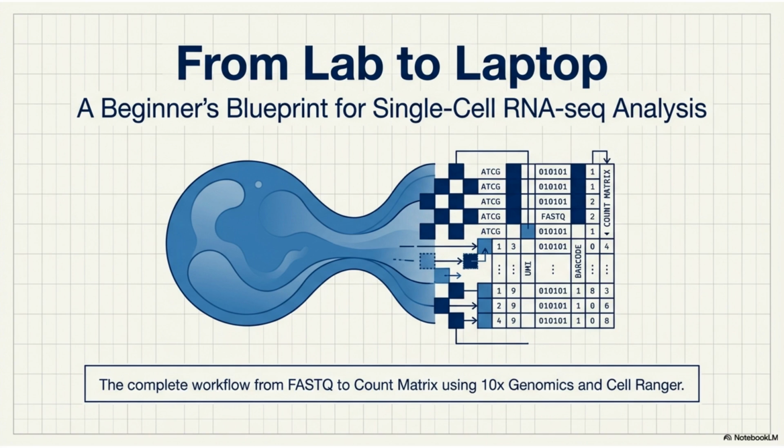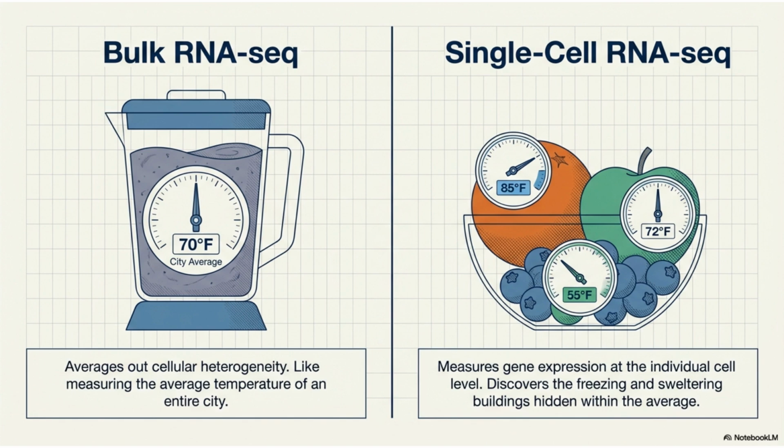Welcome to Affordable Tutor, a beginner's blueprint for single-cell RNA sequencing analysis. This video covers the complete workflow, taking us from FASTQ files all the way to the count matrix using 10x Genomics and cellranger. Single-cell RNA-seq differs significantly from bulk RNA-seq.